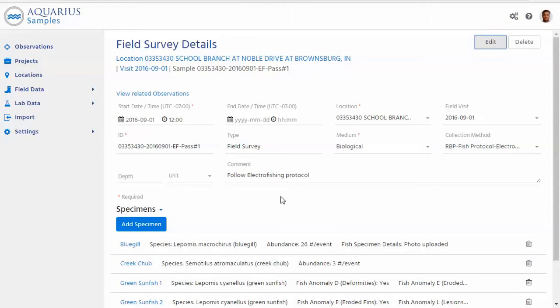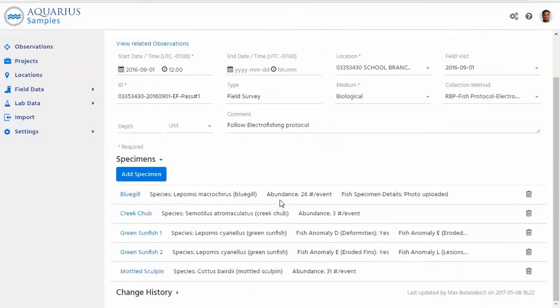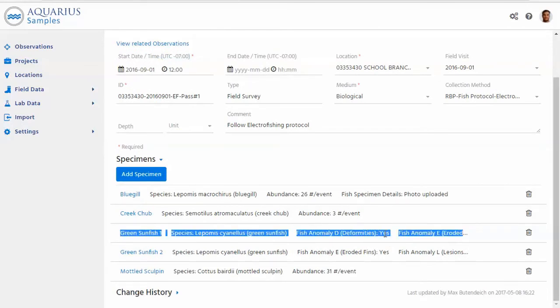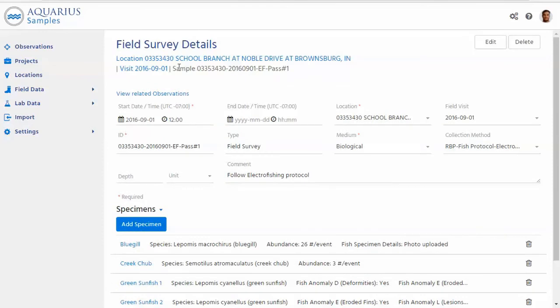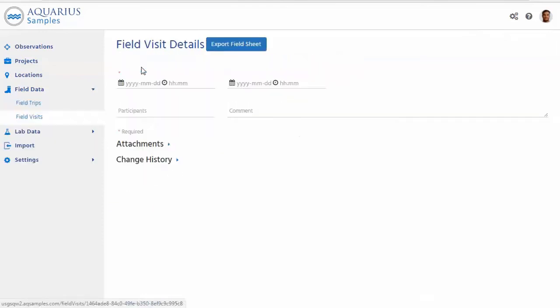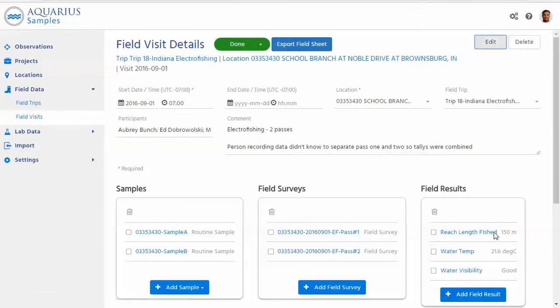So Aquarius Samples can store both numeric and what we call categorical or non-numeric results. So we've already seen a few examples here. As you said, here's some yes, no results could be presence, absence, or if I go back to my visit, I think we had some right here, something like water visibility could be good, bad. So that really allows you to capture a much wider range of data than just numbers.